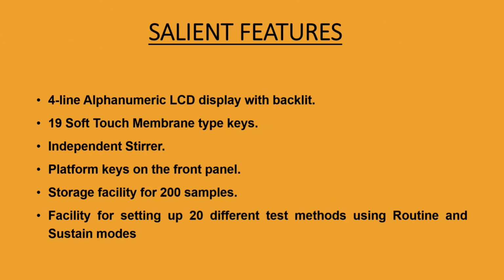Some of the unique features of this instrument are a 4-line alphanumeric LCD display with backlit, 19 soft touch membrane type keys, independent stirrer and platform keys on the front panel, storage facility for 200 samples, and facility for setting up 20 different test methods using routine and sustain modes.